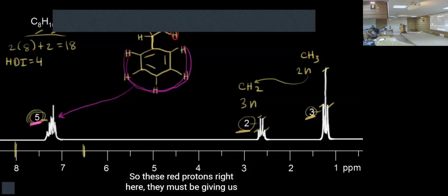Sometimes, when you isolate a compound using methanol and silica, then you could see the signal of silica as well. And then sometimes they also integrate that, so you should know as a scientist what needs to be considered and what not.